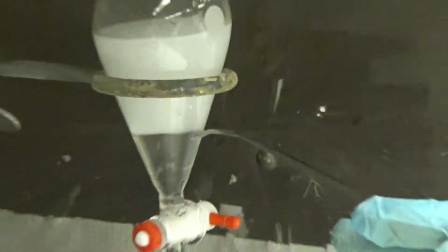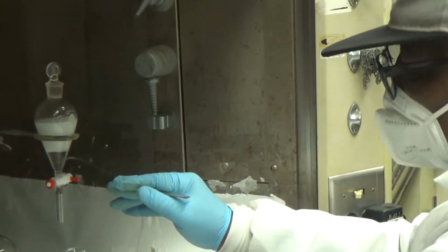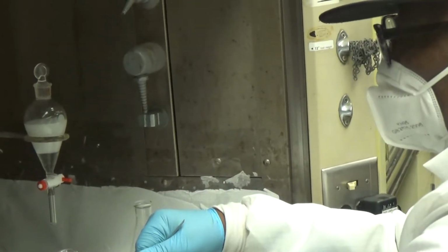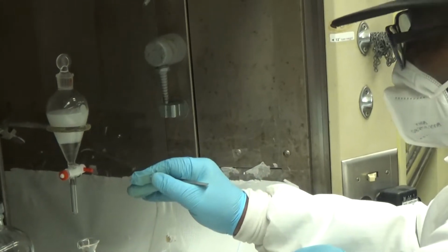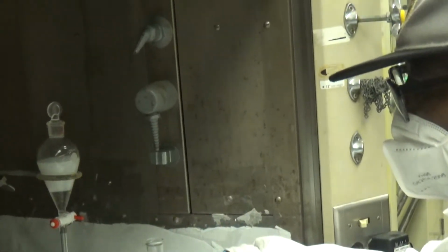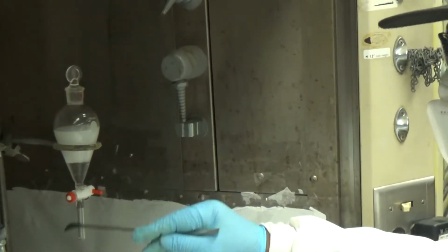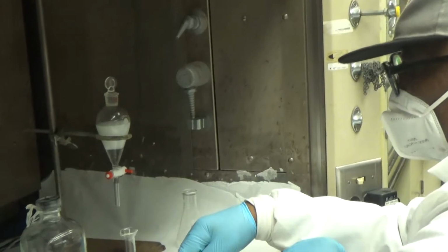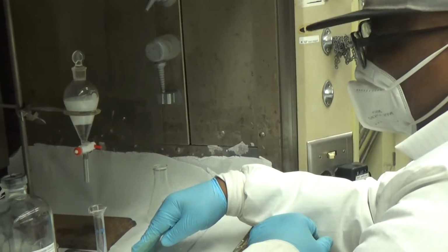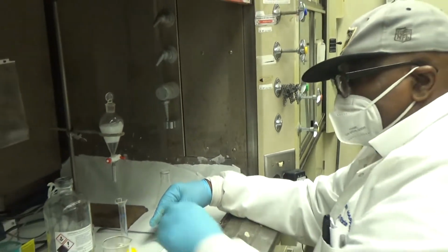So the organic layer, in our case the methylene chloride layer, is the bottom layer because methylene chloride has a density higher than the density of water. The compound with a lower density will be the top layer, and the compound with a higher density will be the bottom layer. So the water's 1.0, and methylene chloride is like 1.2, I think. So the water's on top because it's less dense, and the methylene chloride is on the bottom because it's more dense. You can look up those densities on the internet.